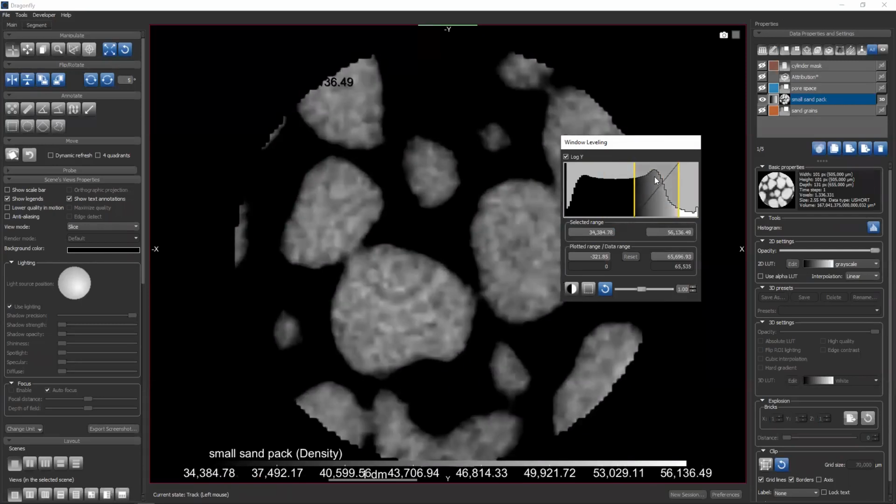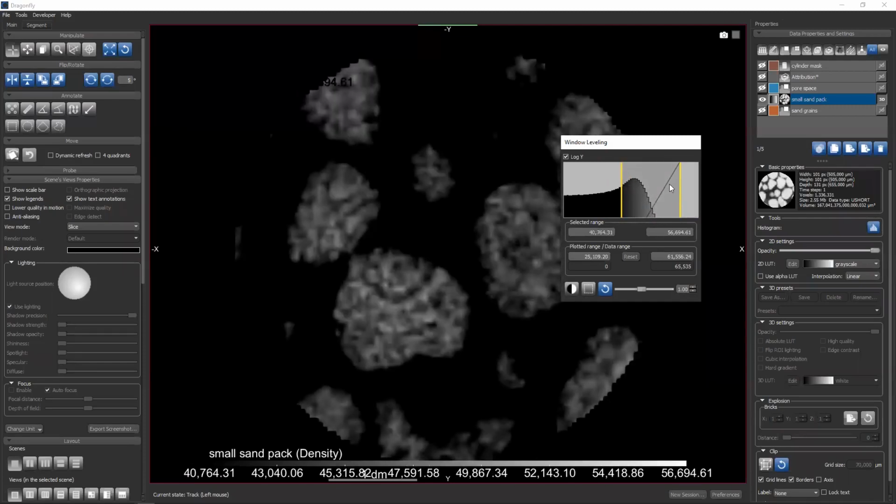If you want to zoom in here, I can. On an older release of Dragonfly, there was actually a zoom button somewhere down here. Now it's just interactive. I can use the scroll wheel on the mouse to zoom in, and it does resample this histogram, so it gets higher and higher resolution. Once I'm zoomed in, I can, well, let's see. Yeah, it's not inside the window, but if I'm outside the window, I can drag with the left mouse. And this behavior is improved in 2020.1.